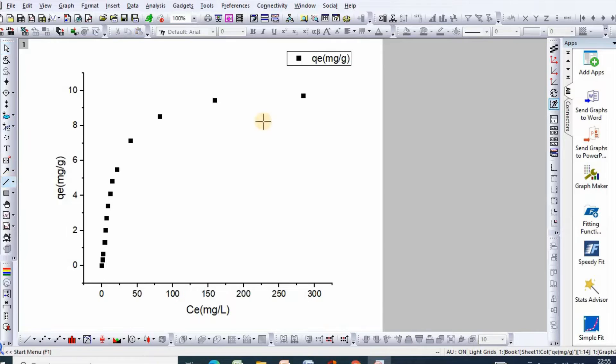Then, draw a line along Y axis and put your cursor here. Here, it's 9.82. So, your QM is 9.82.